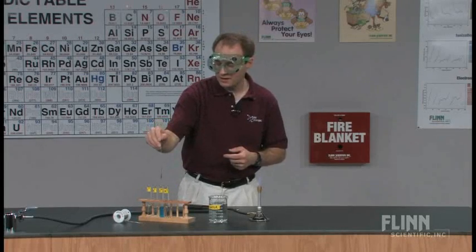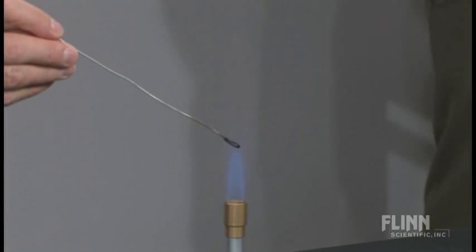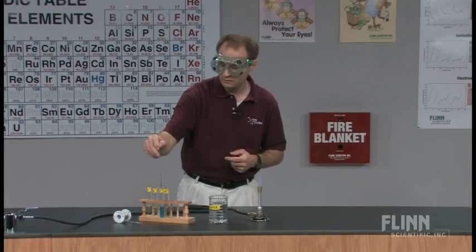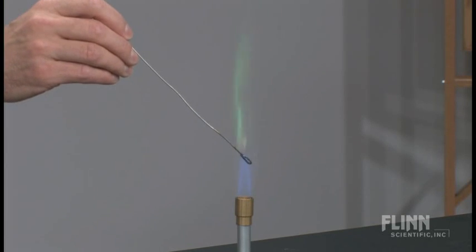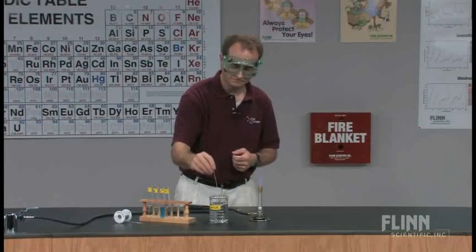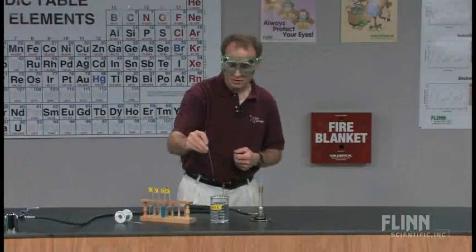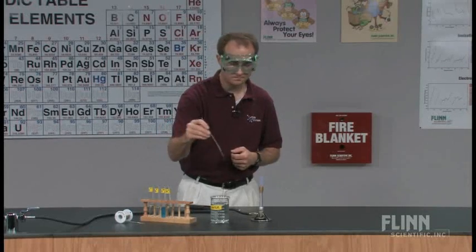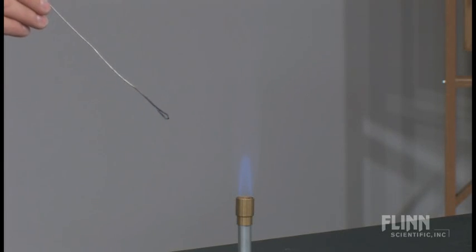After rinsing again, it's on to the copper test tube. That one happened quickly — let me run that back. We see the greenish color of the copper flame. And then to the potassium — we see a lavender type of color for that flame.